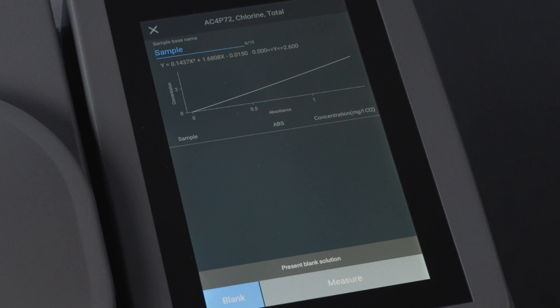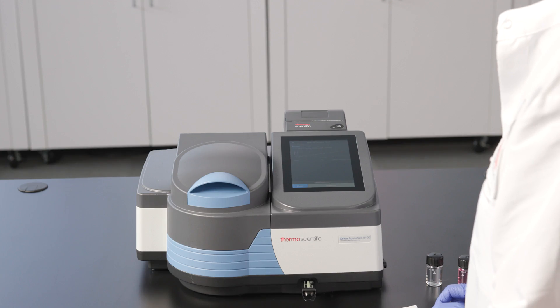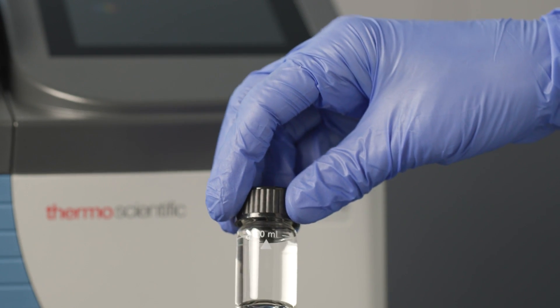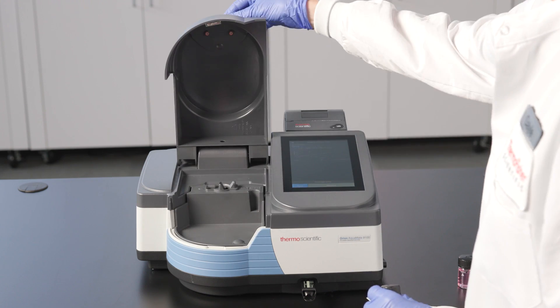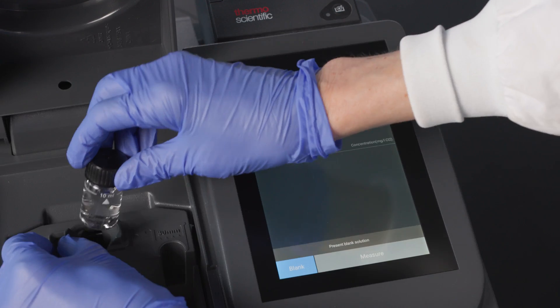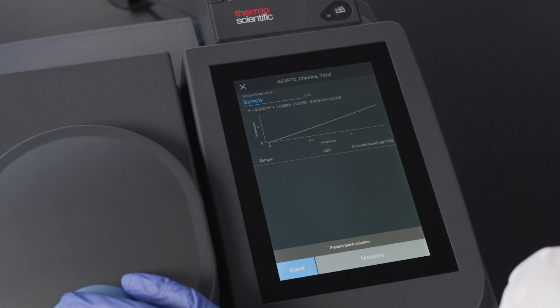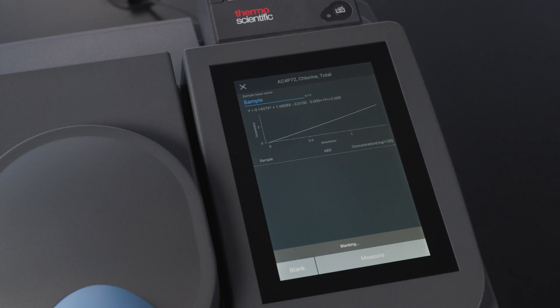This brings us to the measurement screen. As part of the measurement process, we first need to run a blank. In this case, it's 10 mils of our sample placed in a vial. All we need to do is open the cover, pull back the retainer, and insert the vial with the arrow aligned forward. Then we can close the lid and select blank. And in a couple of seconds, it will tell us that it's done.